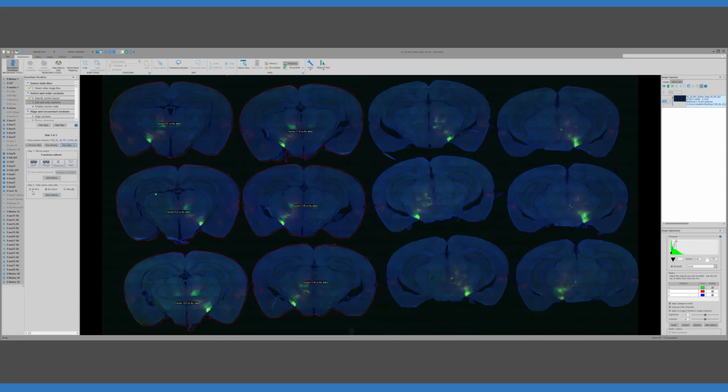How it does the ordering is by row or by column or manually. So we use the by column version. So now we've done the 2 slides for the example. We're going to go into the next step.